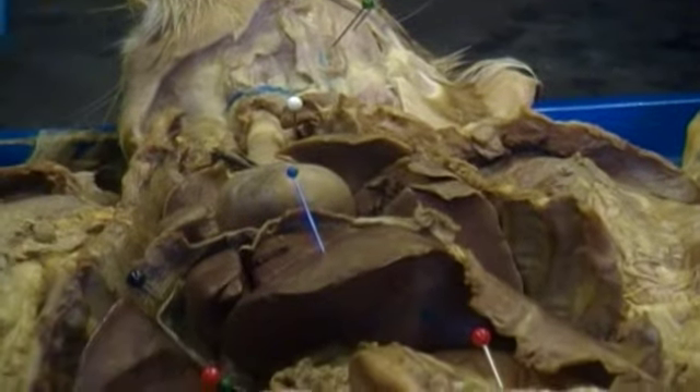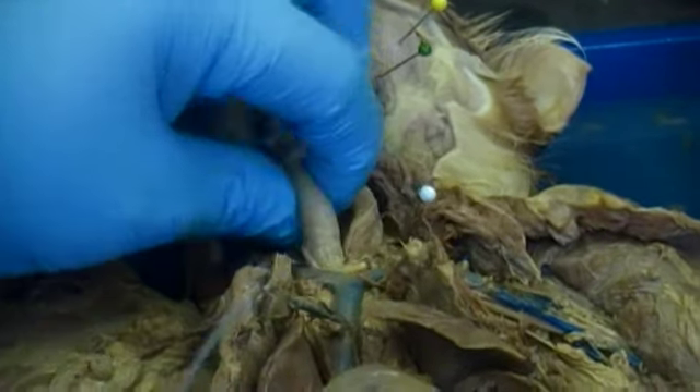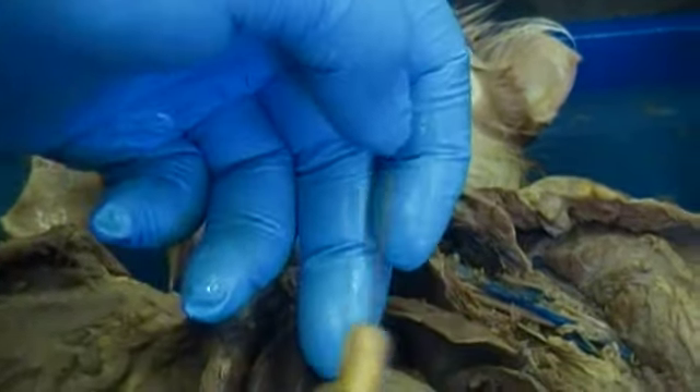As we head downwards, we have the trachea. Just below the trachea, we have this structure labeled with a white pin, which is the esophagus. The esophagus runs all the way down past the heart and through the diaphragm towards the stomach.